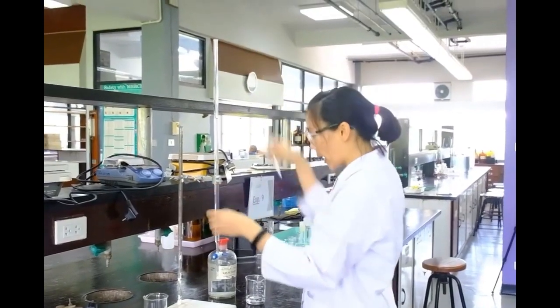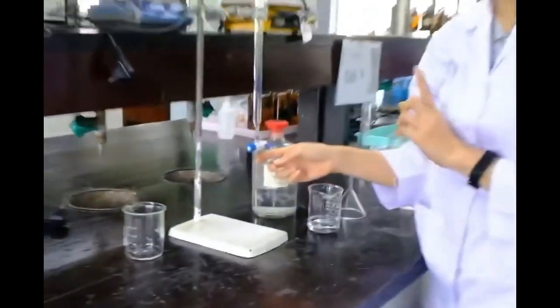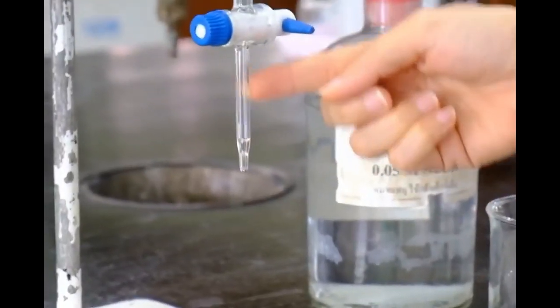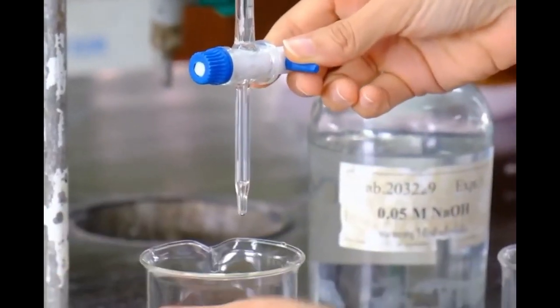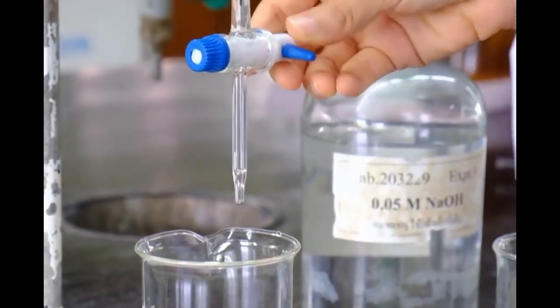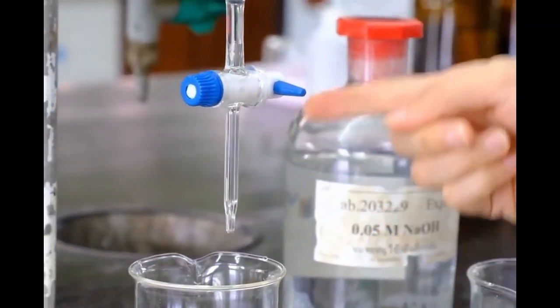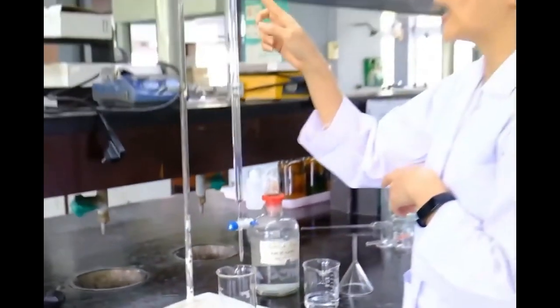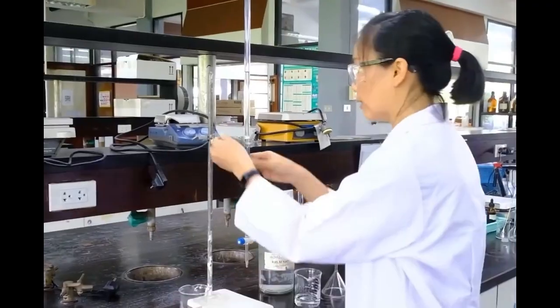Check for air bubbles at the tip. If there are bubbles, release the sodium hydroxide solution into the receiving container and let it drain until there are no more bubbles. Next, have the students add the sodium hydroxide solution until the initial volume is 0.00 and record the initial volume.